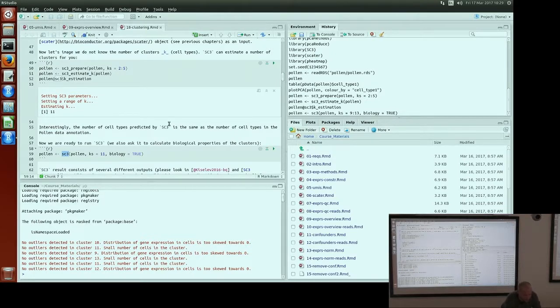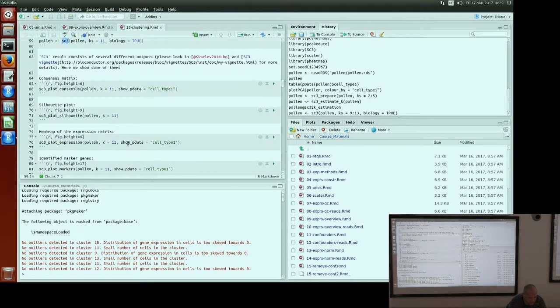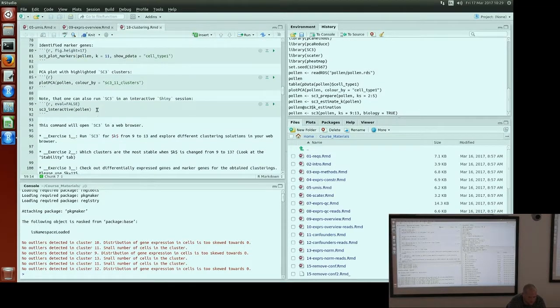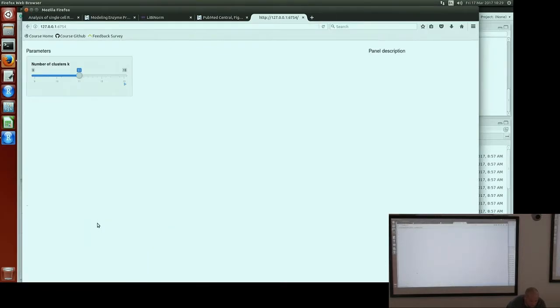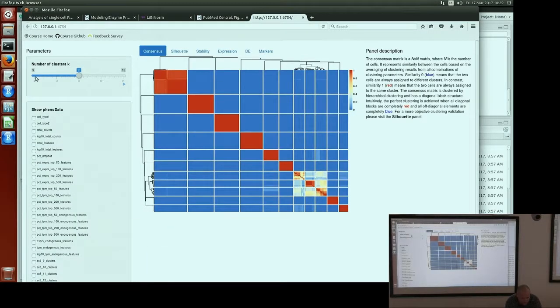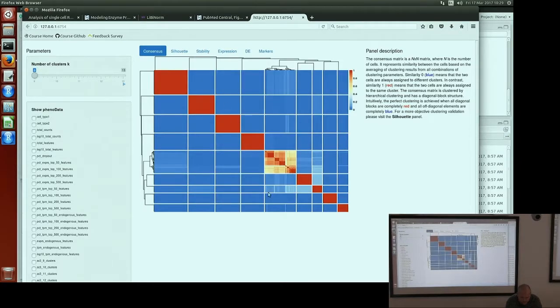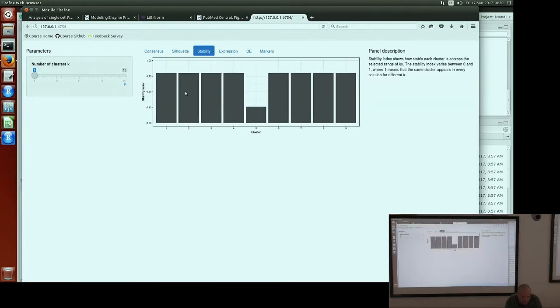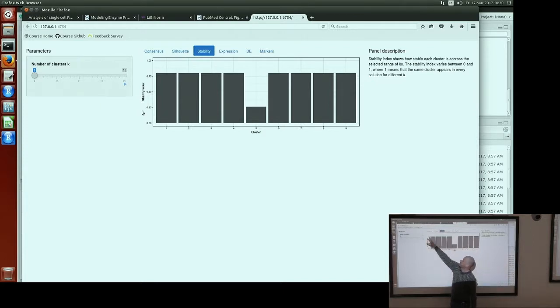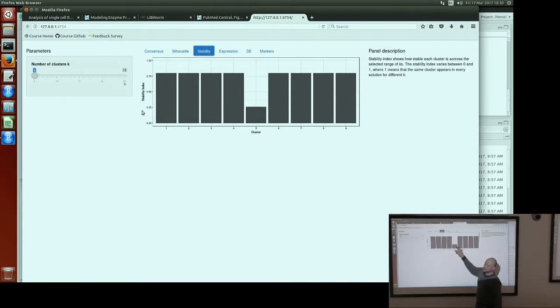SC3 is finished. We can now open it in an interactive session. As you can see, we have k from 9 to 13. You have a slider and you can change k to see how your consensus matrix changes for different k values. Also, there is the stability plot. For k equals 9, it tells you that eight clusters are quite stable with stability close to one — meaning the cluster doesn't change when you change k. One cluster is unstable.